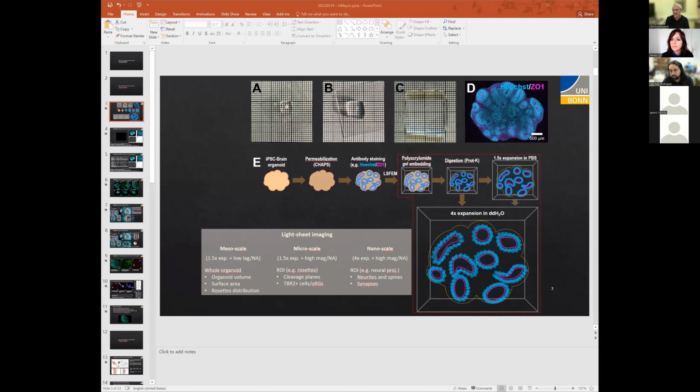In that case, we can detect two channels simultaneously, because you need a dichroic mirror to distribute the fluorescence into two channels. You can principally expand that by using more of such devices. But in view of the fact that one of them costs about 30,000 euros, you have to think about the costs of your instrument. But there is in principle no limit.